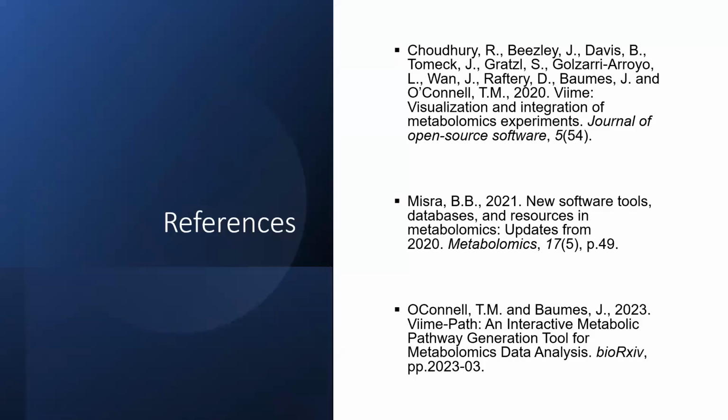Yeah, and I think also with the metabolite autoplotter, you can have more customizable graphs. You can play around a lot more, whereas MetaboAnalyst has only one type of output. If you want to play around with the colors and the formatting, the autoplotter is quite useful.